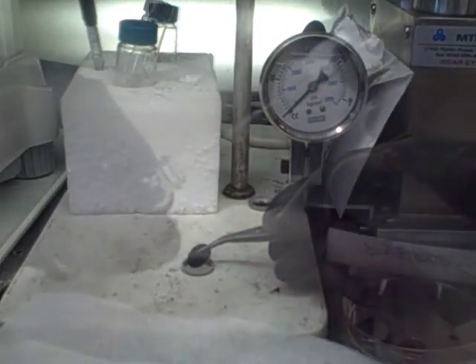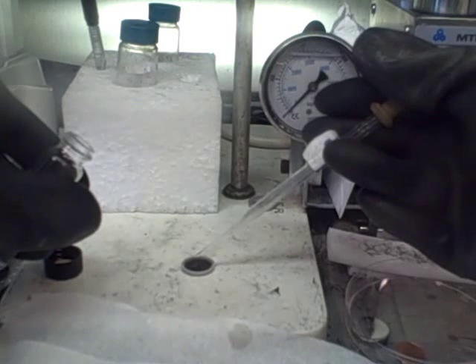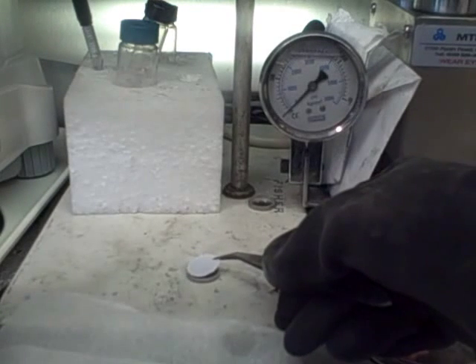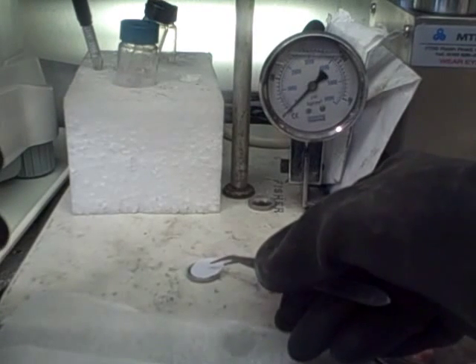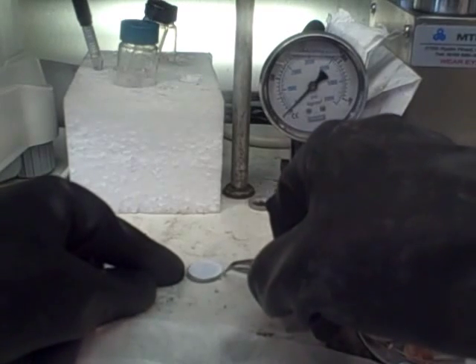The anode material is then placed in the container. A few drops of organic electrolyte will allow lithium ions to move through the cell. A polypropylene separator is then placed over the anode to block electron flow, allowing only lithium ions to cycle through the battery.